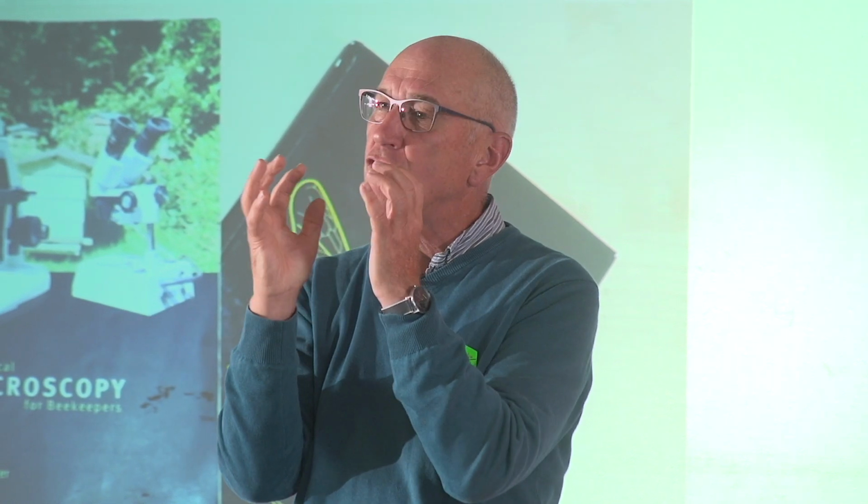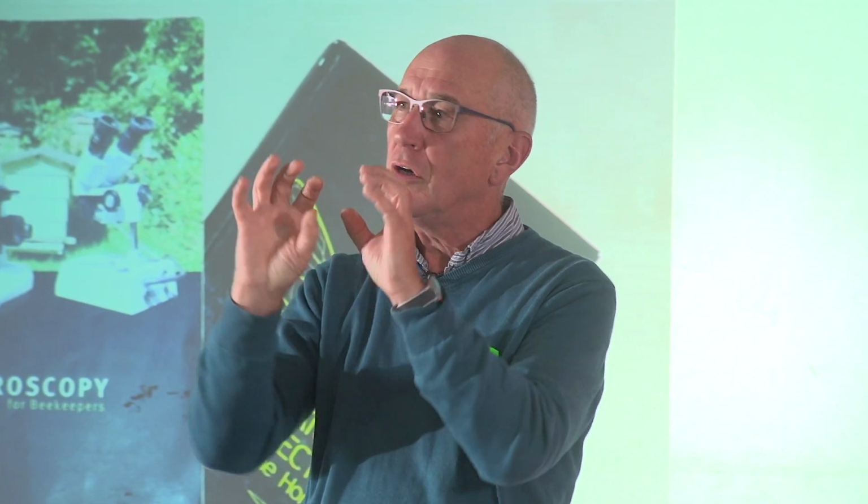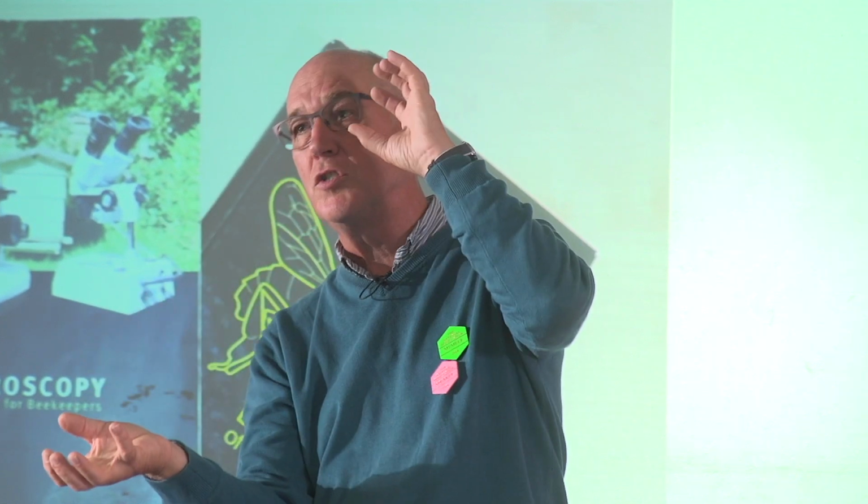The problem with taking a pollen load or even bee bread is that when you take the small sample and put it onto your slide, it just fills the slide and you can't see the detail. If you have too much pollen in a view, you can't see. You want to see in different orientations to be able to get the view, and it overlaps.